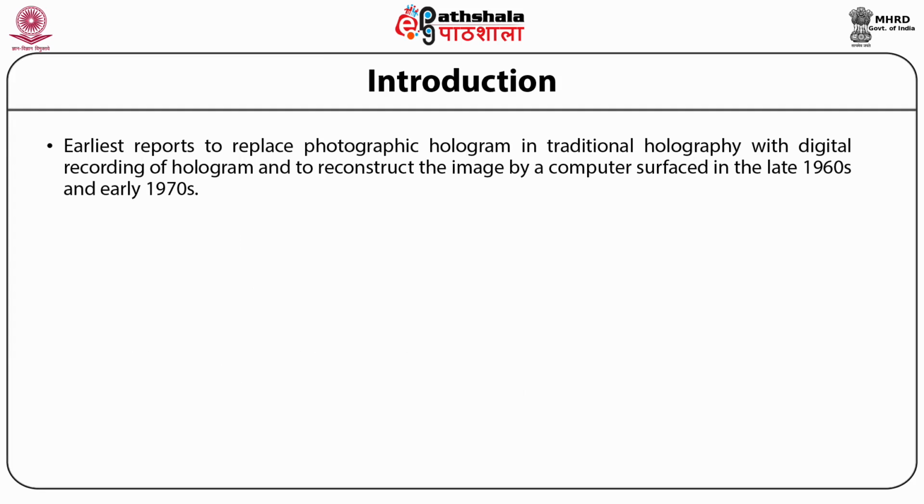The earliest reports to replace photographic holograms in traditional holography with digital recording of the hologram, and to reconstruct the image by computer, surfaced in the late 1960s and early 1970s. The early 1980s saw similar ideas for electron microscopes.